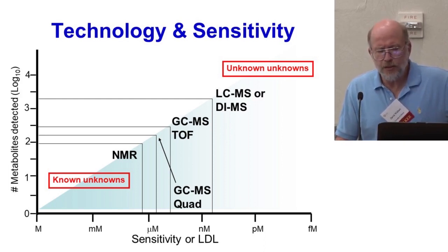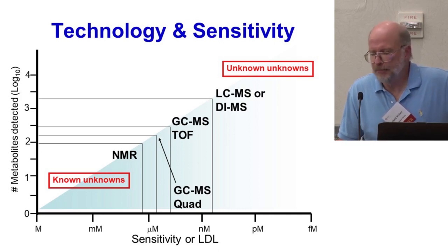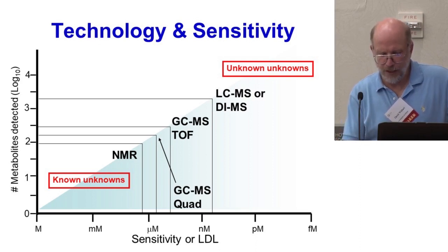So the tools themselves, especially in many metabolomics labs, actually use all 3 major techniques. They are complementary. Some allow you to see hydrophobic molecules better than others. Some allow you to see volatile molecules better than others. Some allow you to see sugars as opposed to organic acids.